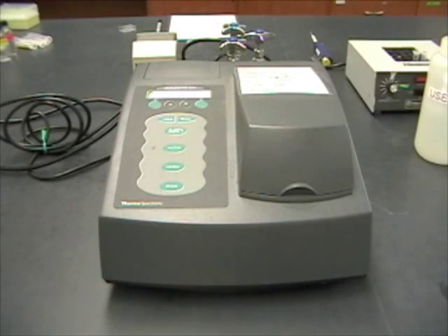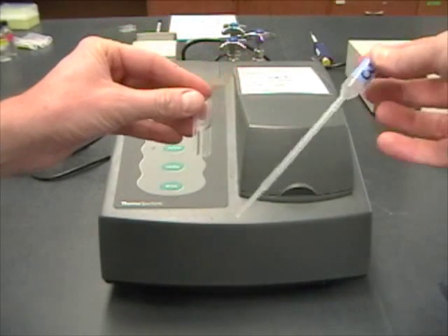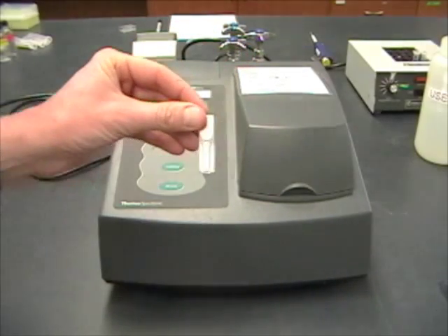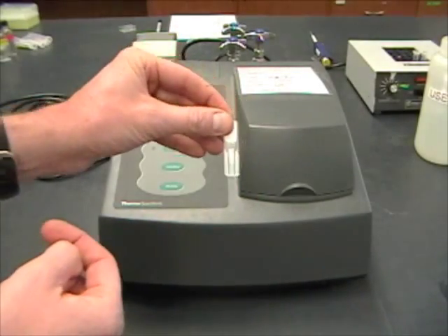Now it's time for one of the first measurements on the spectrophotometer. At the start of each time point, I used my pipettor to take one mil out of my flask and put it straight into this little cuvette. The purpose of doing that is to detect how many bacteria are present in the cuvette.